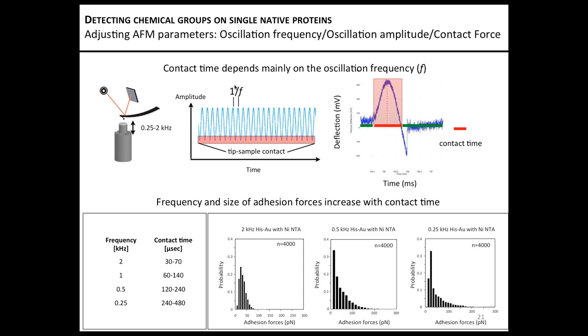Another relevant question regarding the scan rate, which you typically use for this type of measurement. What do you use now? In my case I try not to go so fast, and it also depends on the frequency that we use, but the scan rate is about 0.1 to 0.2 Hertz.